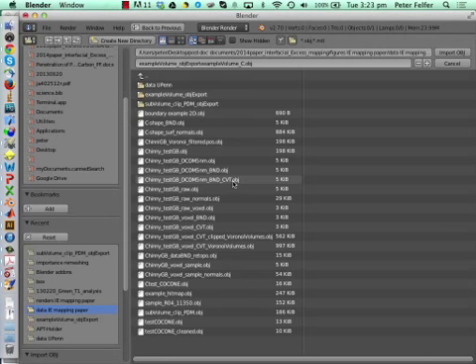Well, you can create a new hull. You can always calculate a new hull. That's why we're using alpha hulls in this case, because an alpha hull can always be computed for a point cloud. Whereas the more modern approach, when I do my own reconstructions, I reconstruct a hull of the dataset along with the reconstruction, which makes it a lot prettier, because the alpha hull is not going to be a pretty triangulation. Because if you imagine you've got random atoms sort of randomly poking out of the surface, and that's going to form your surface.